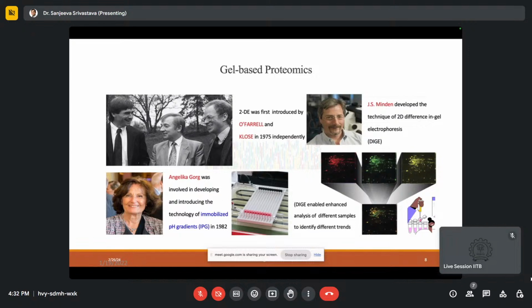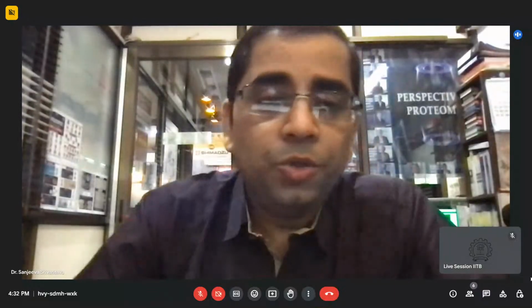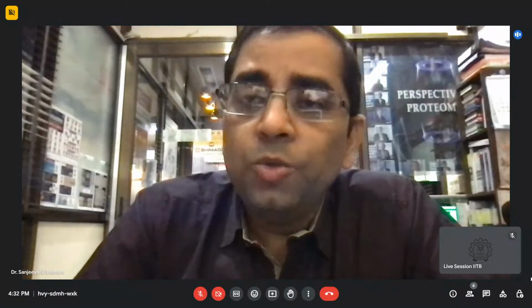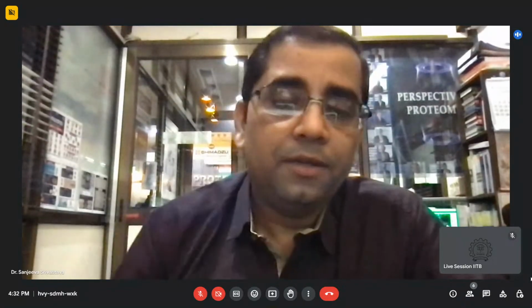So, having said that, let's now move on to the lab, where Aishi is going to show you something as basic as the SDS-PAGE, and then we'll talk about the 2D gel and other technologies. All right, Aishi, to you now.